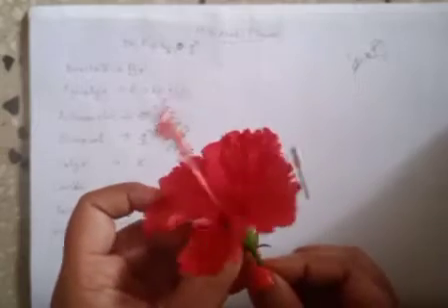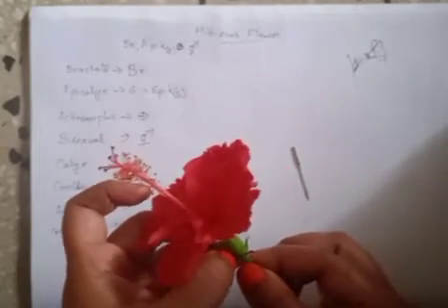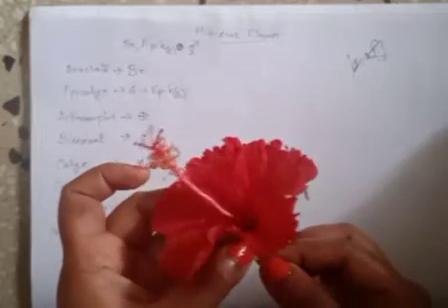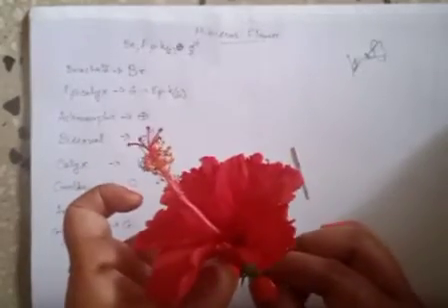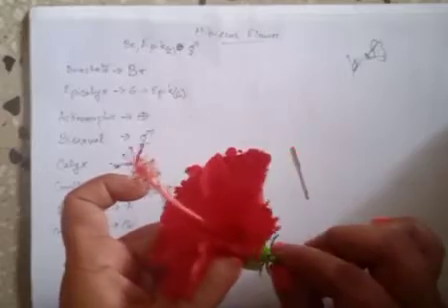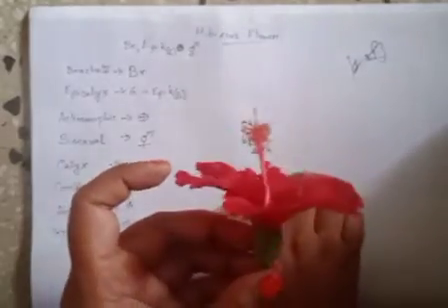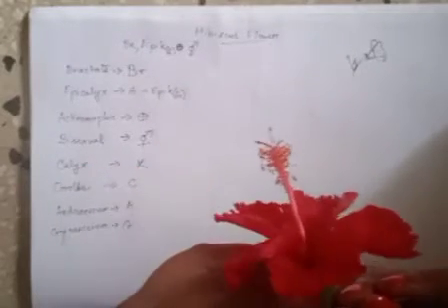Okay, so I am just going to remove the calyx very carefully. So do not harm the epicalyx. If it's not getting removed, I can take the help of my needle to get it removed.